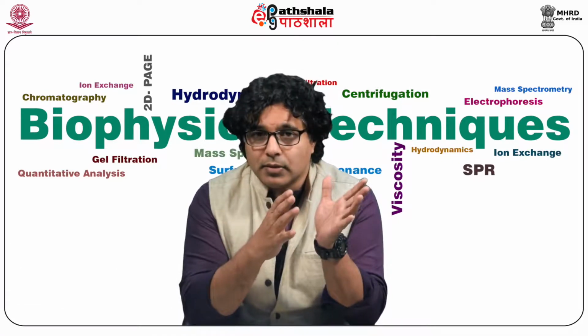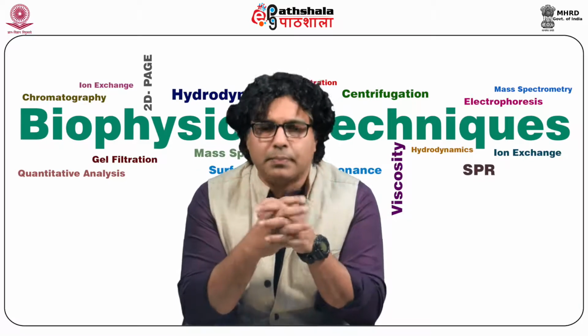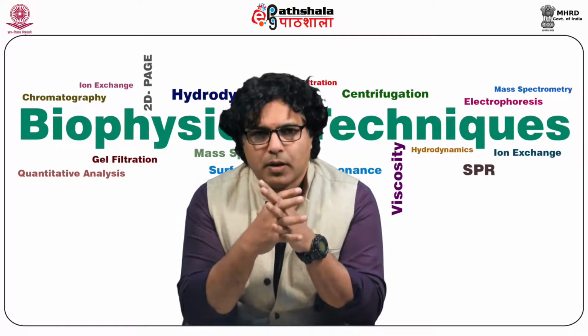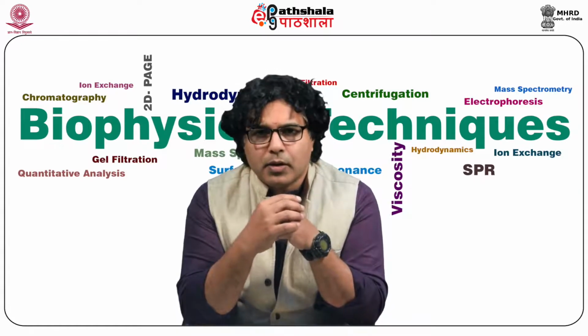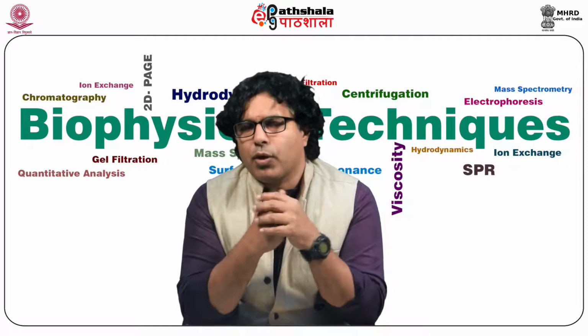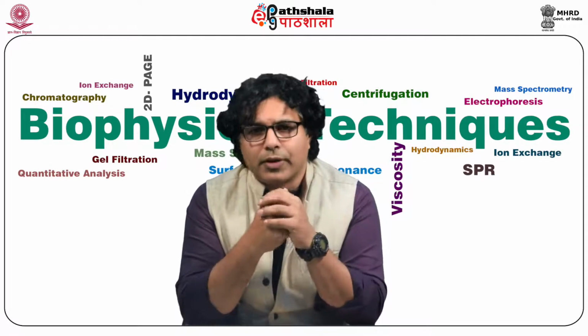Chroma means color, and graphy is the technique through which separation happens based upon color. Where we are using liquid, it is liquid chromatography. Sometimes instead of liquid we use gas, and then it is gas chromatography.